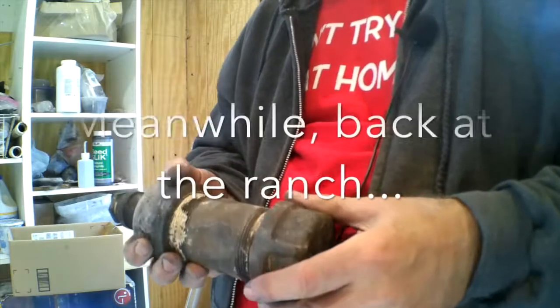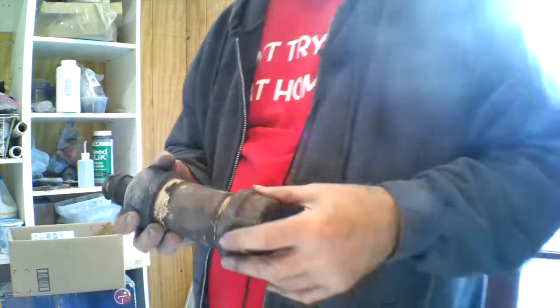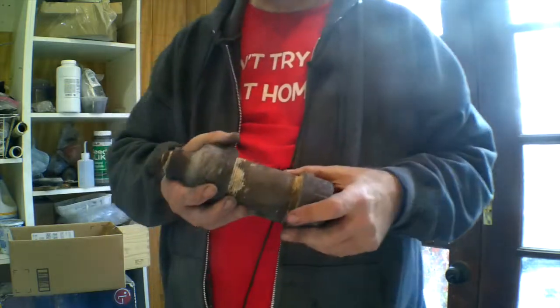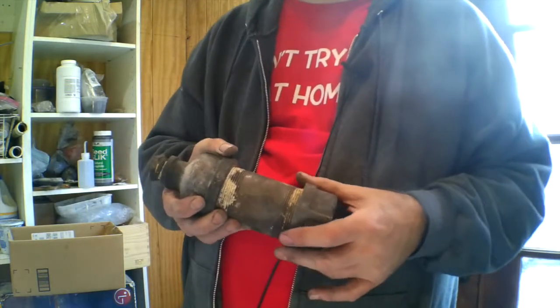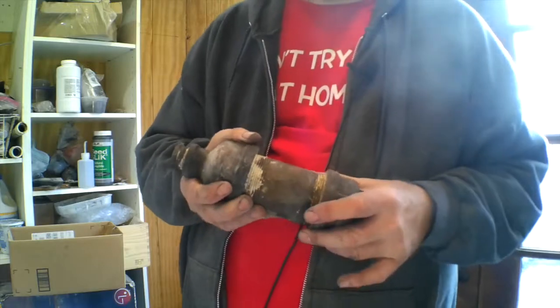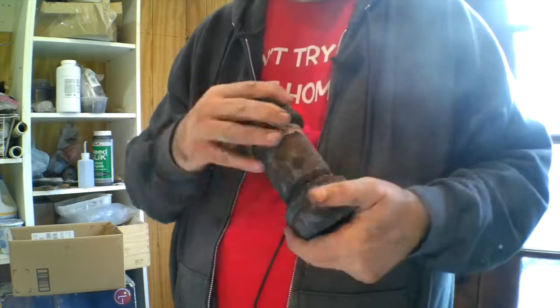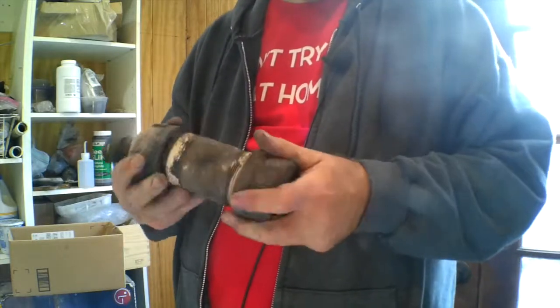I'm thinking that my issue with trying to reduce potassium out of that plant-derived potash is that I really don't know what was in that product, that brown potash. I mean, I know that it had some potassium carbonate in it, but it probably had some sodium carbonate in it too, and frankly, it probably had some calcium in it. So I don't know what caused that hissing noise when I quenched that reaction vessel. So I'm going to come back to the base principles, and here's a nice big reaction vessel.